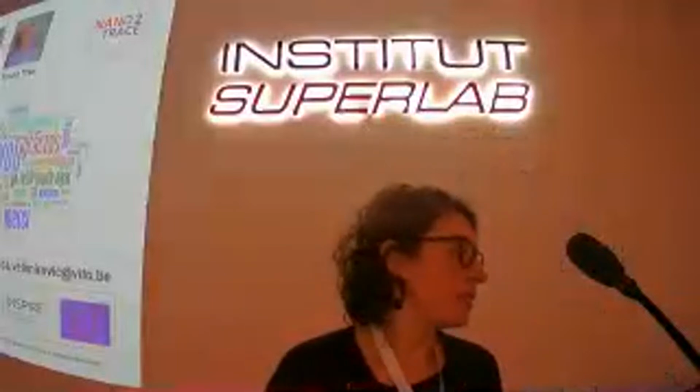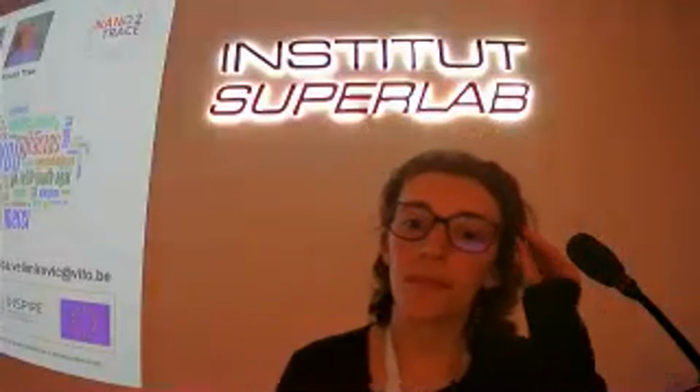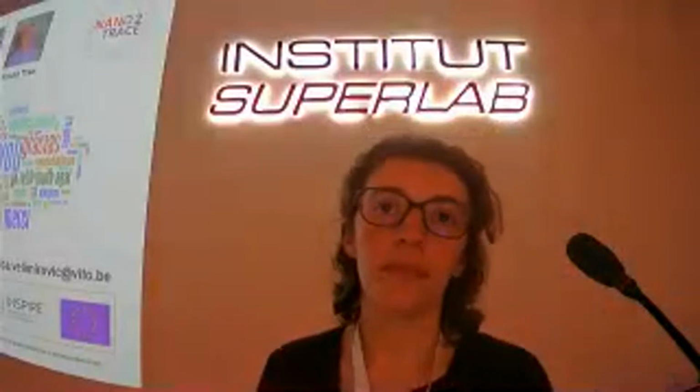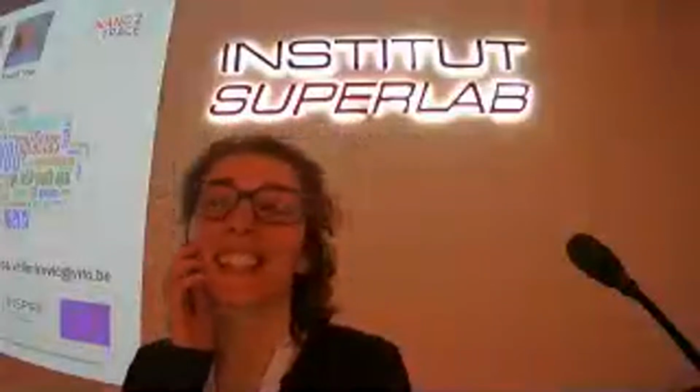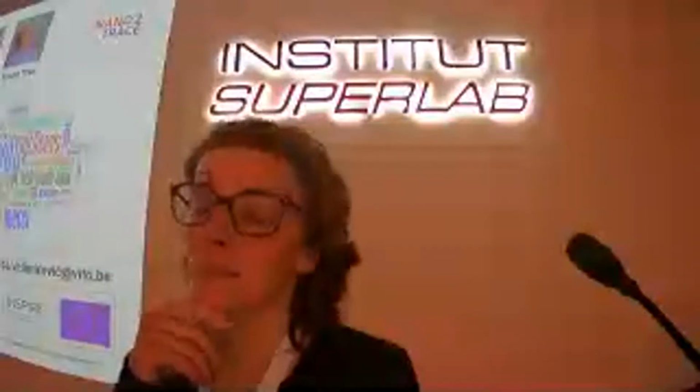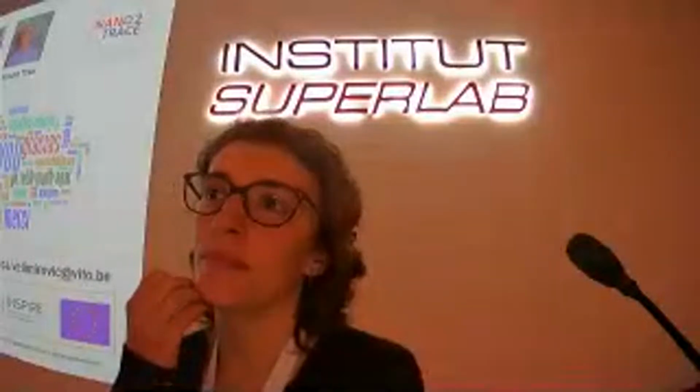Another question? Thank you for the presentation. I have two questions. For the sample preparation, when you measure particle size for nanoplastics, do you remove the larger particles, because using DLS or A4F will be a problem?